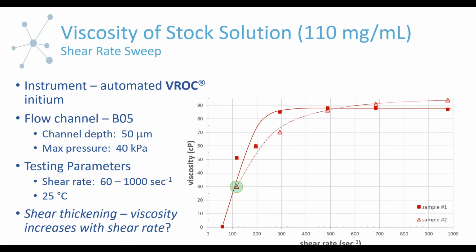So starting with the stock solution, with that initial preparation, with the relatively limited time of mixing, what we're going to look at here is shear rate sweeps. And we are using, in this case, our automated VROC initium with the flow channel, which we describe as B05. So what that coding just means is it corresponds to the flow channel depth, and then the maximum pressure that can be handled by the flow channel. So the channel depth is 50 microns, max pressure 40 kilopascals.